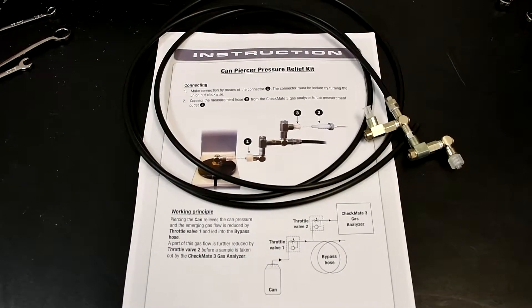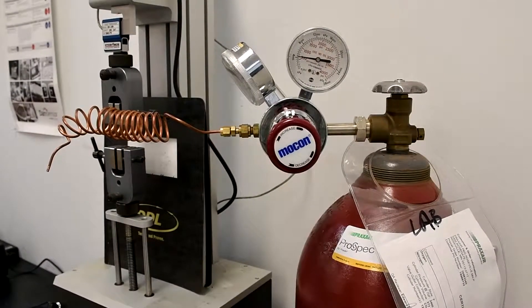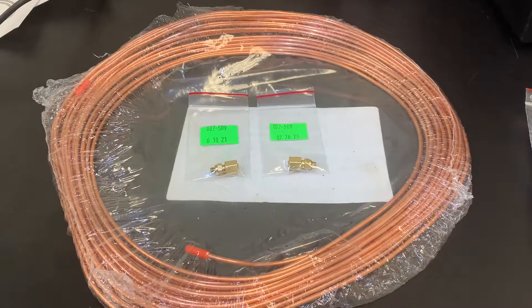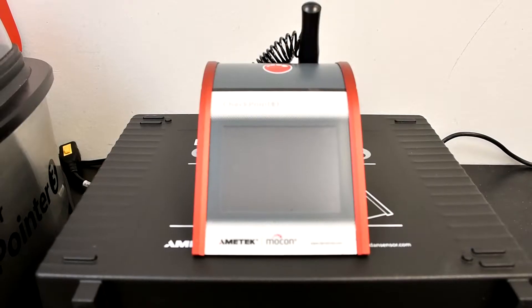Here's what you'll need. The pressure relief kit, included in your field verification kit. Gas tank, we recommend a T-size. Connections, connector fittings and copper tubing included in the field verification kit. The Dan Sensor Checkpoint 3.